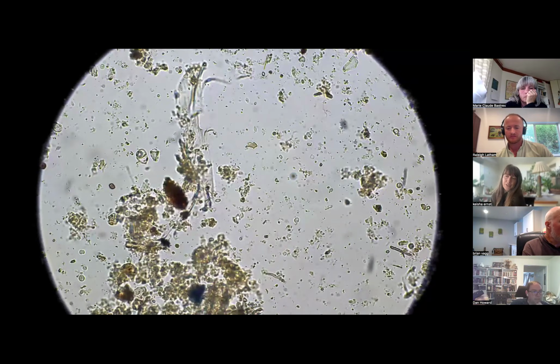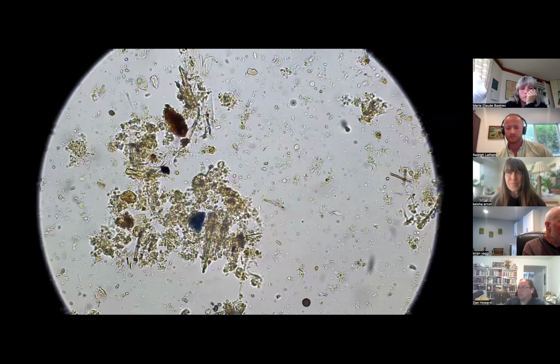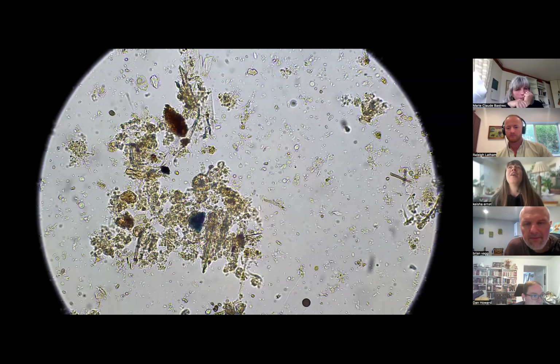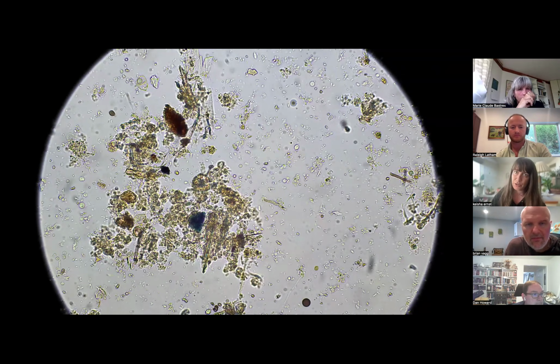Well, I guess we're going to have two different formats. So we'll have one that's super, super simple. I call them quick checks, and it's more just talking about what you see very quickly. It's basically splitting up all of these different microorganisms into groups and giving yourself space on a paper to be able to write things out or type in notes.